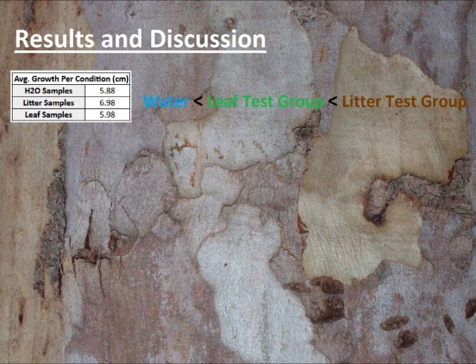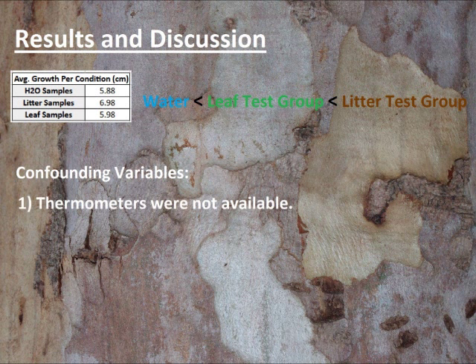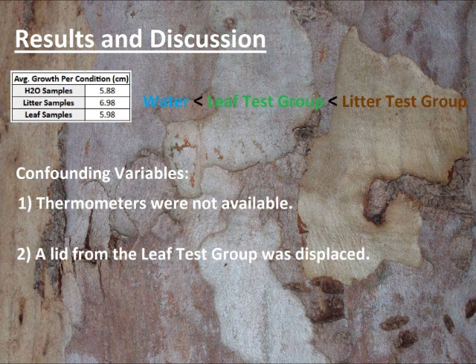But before we go jumping to any conclusions, let's list a few confounding variables that could have played a role in our results. One: we did not have a thermometer available to measure the temperature of the water when steeping the leaves and litter. This could mean that the temperature varied for each group, or it could mean that the water was too hot altogether and killed off any possible biochemicals from the eucalyptus. Two: after the seven days passed, we noticed that one of the lids to our petri dishes in the leaf test group was displaced, and the water had completely evaporated.